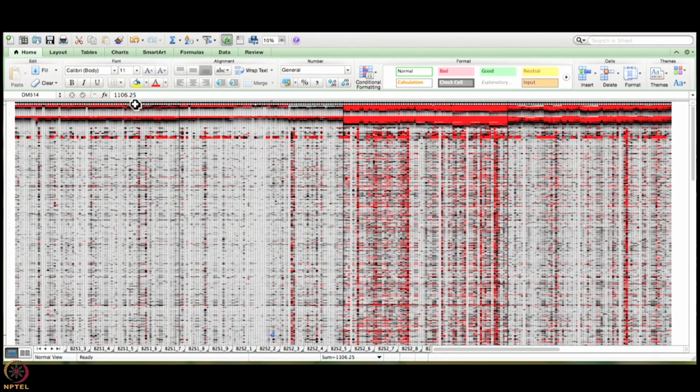So you will know that mainly from the IgG signals here. This particular line which you see here is all your IgG mix, and this particular line which you see here is your anti-human IgG. So basically this is your control which is going to tell you whether you need to rescan your slide or not. So if this is very high, then all your signals by default for this particular batch will also be high, right.